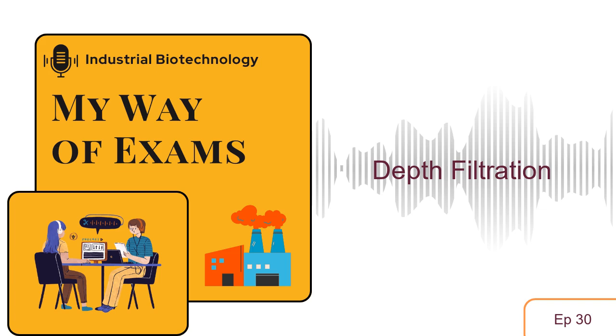All right, so let's just quickly recap the main points here. Depth filtration, your go-to for cost-effective initial particle removal in bioprocessing. It works by trapping those particles within its three-dimensional structure, unlike a simple screen filter. And it really excels at pre-filtration, getting rid of all that big debris and clarifying liquids that start out with a high concentration of solid particles. Exactly. And it's that crucial first step that protects the more advanced purification methods down the line, making the whole process much more efficient.